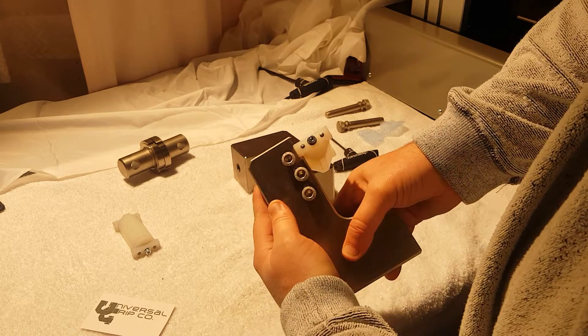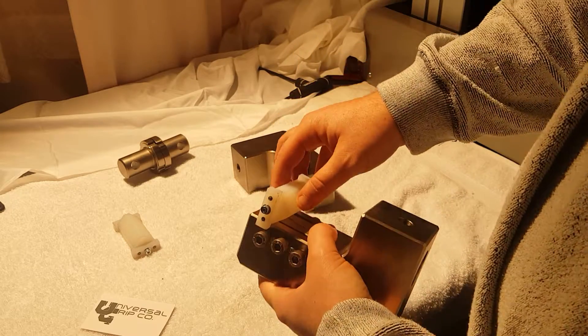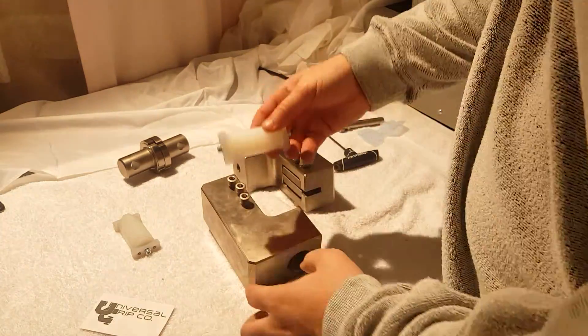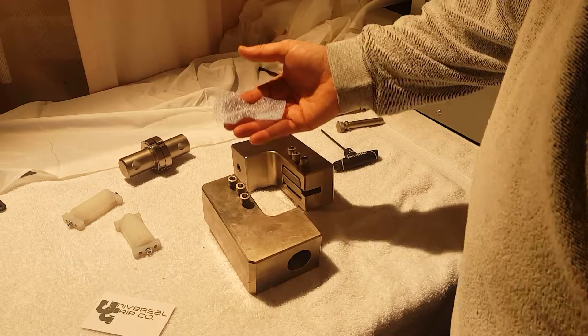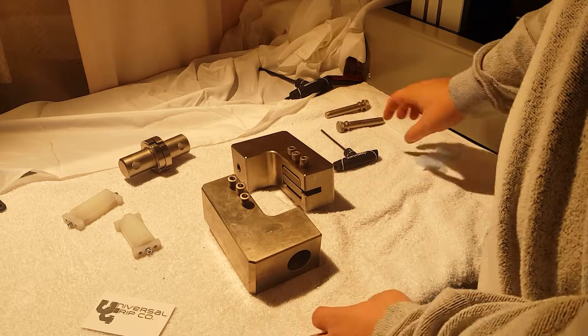It just helps you get your sample aligned, but it's definitely not necessary, although most people do use it. We're not going to use it today just because it slows things down a little bit and we want to keep this video moving. So I have my sample here — again more of a flimsy sample — and we're going to use this to test.